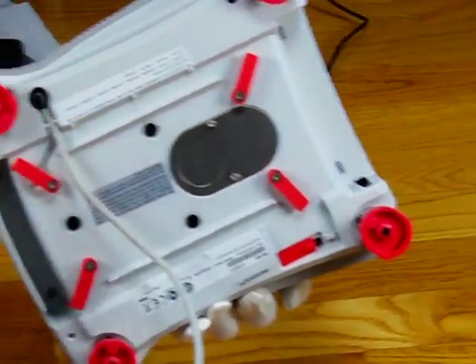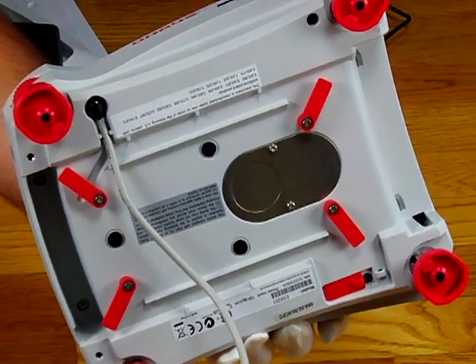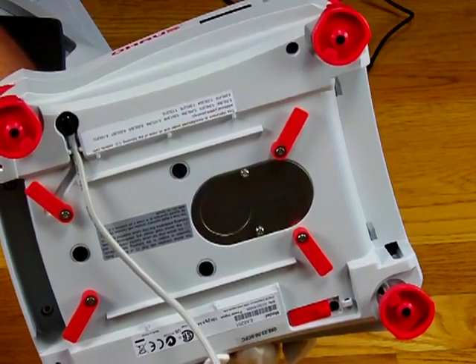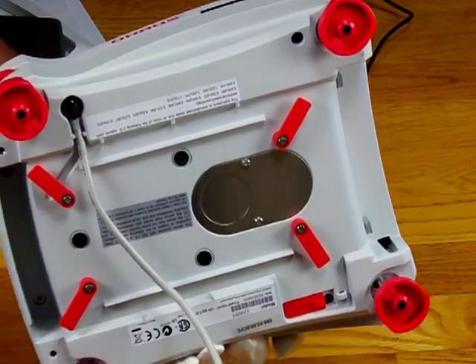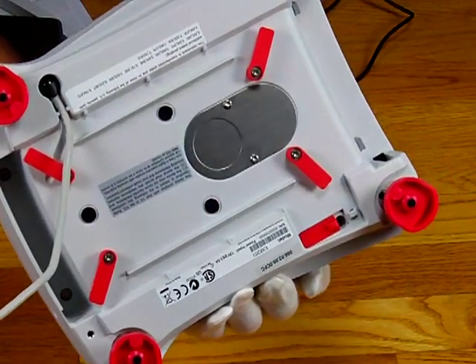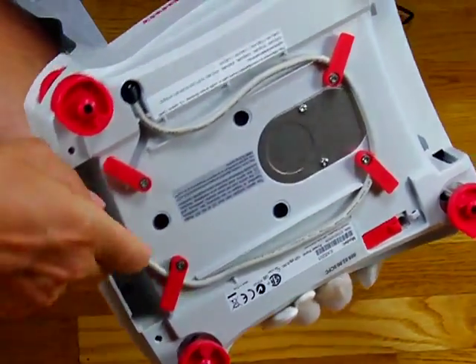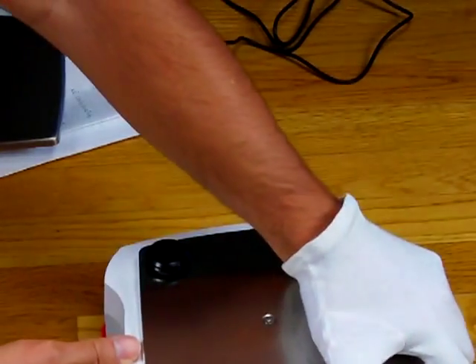We also have this port here for the weigh-below function. If you were doing something like specific gravity, or weighing a hot item — since heat affects the balance — you wouldn't want to place a hot item on the pan; you would hang it below. You open up this port, there's a little hook, you'd hang a wire and do your weighing beneath the balance. It's also used for very large items that would overhang the platform. This is our one-meter cord — when not in use, simply wrap it around the base and these hooks, and the indicator snaps in the front.